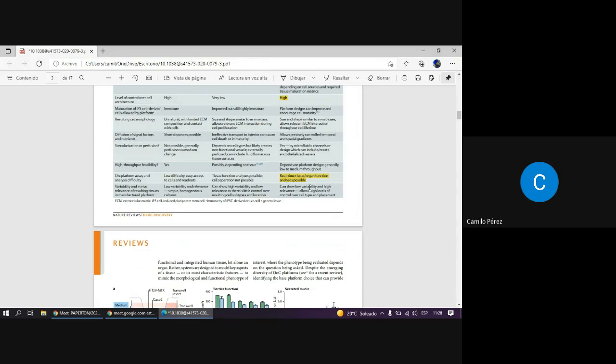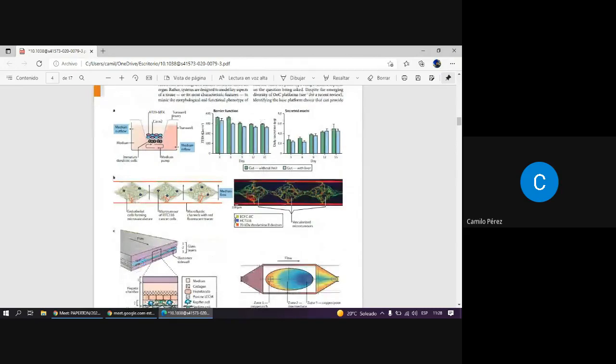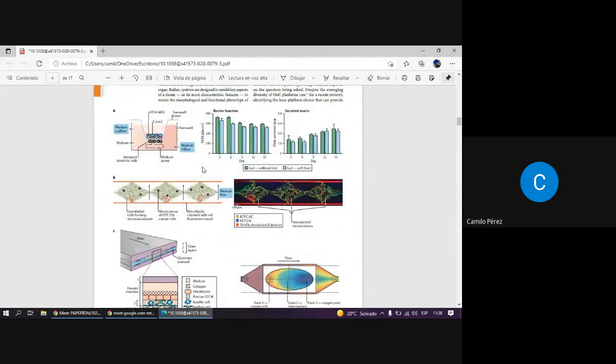For example, in our system we take many photos in the experiment. Also, we look at the different strategies to understand the physiology and behavior of cells in different strategies for cell culture.